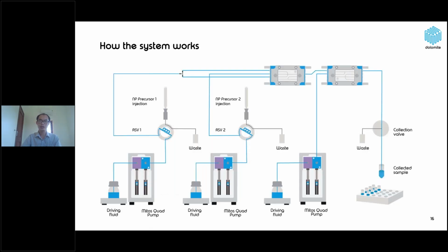Here is showing the diagram for how the system works. Basically, we have 3 pumps.